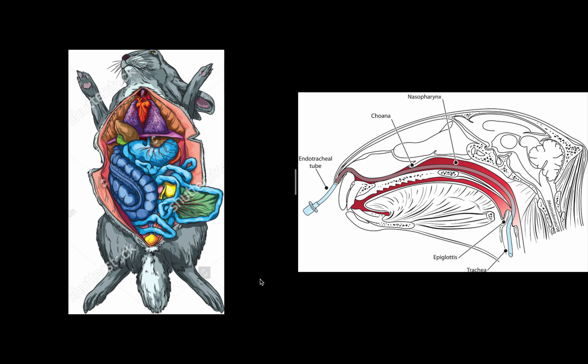Our journey of oxygen begins when the brainstem sends a message to the diaphragm, this thin, purple-looking thing, which is a muscle under the lungs. The diaphragm then moves down when the lung expands and oxygen and air enter through the nose and the mouth. From there it enters the larynx, which is right back here.